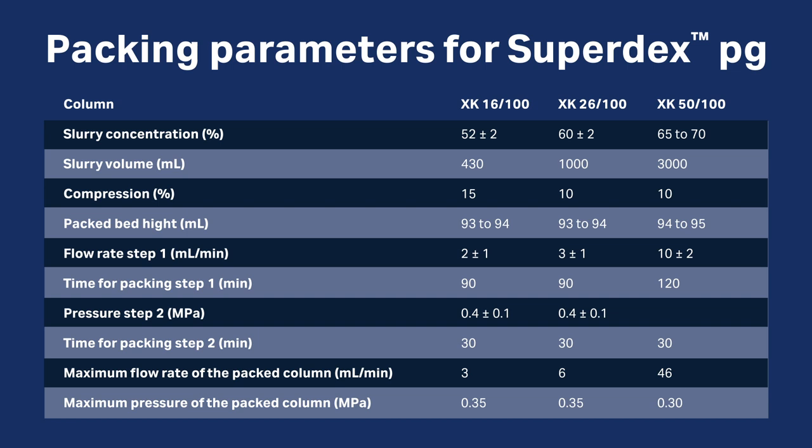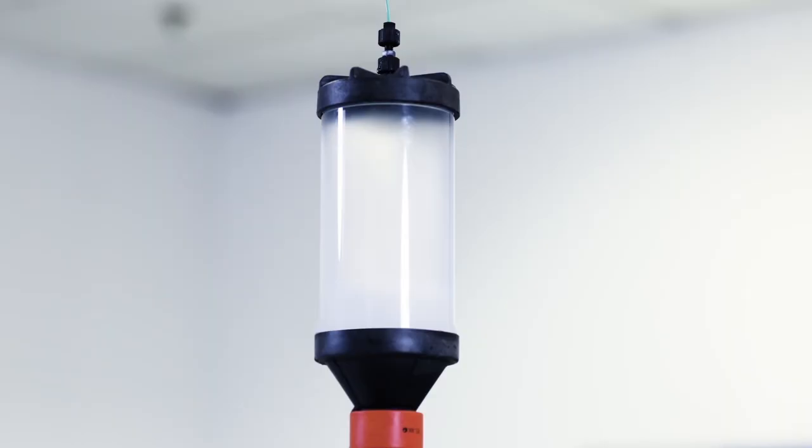If you work at lower temperature, reduce the flow accordingly to avoid high back pressure caused by high viscosity. Now the resin moves down the tube and settles.